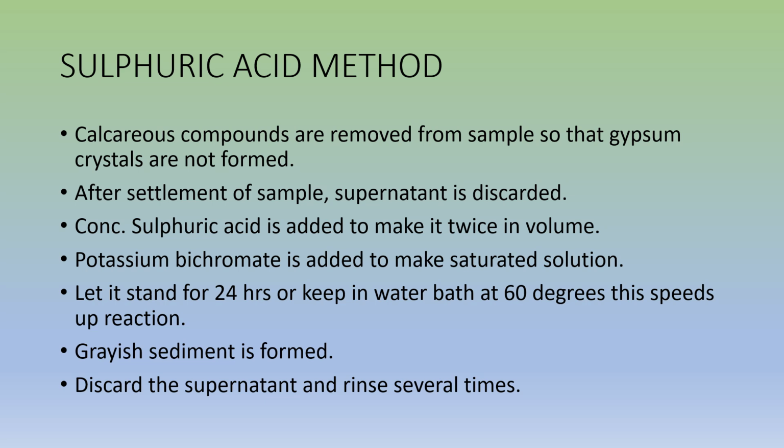Then it is left to stand for 24 hours, or to speed up the reaction it can be put in a water bath at 60 degrees Celsius. After putting it in the water bath, we get a gray sediment in the test tube. Then the supernatant from the test tubes is discarded and the sediment is rinsed several times before viewing it.